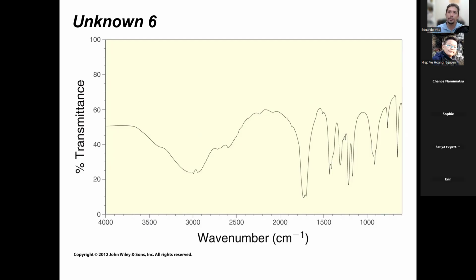This is the equivalent of having a TLC plate with excessively big spots. But if that was the case with you guys, you remember I told you we can still look at it and get some information out of it. This is true for a spectrum that does not look very well calibrated. You could still get some information out of there, but this is where you got to count on your pattern recognition. So, what if you have to guess, what do you think is in this spectrum right here?